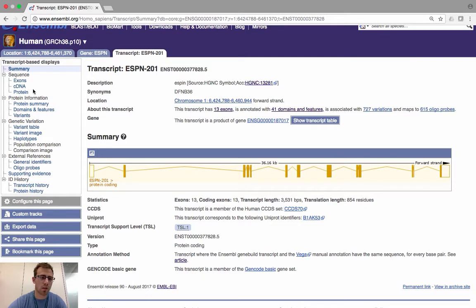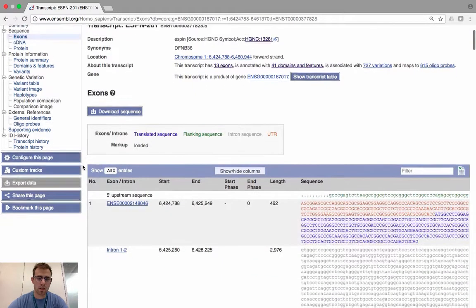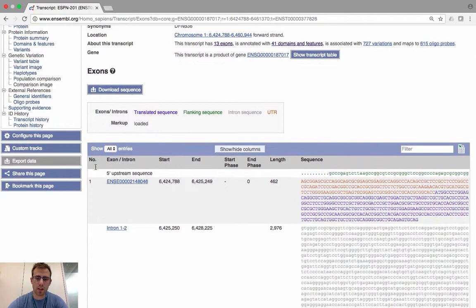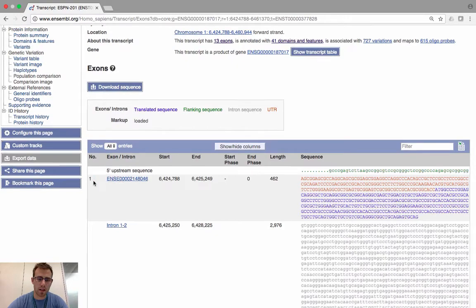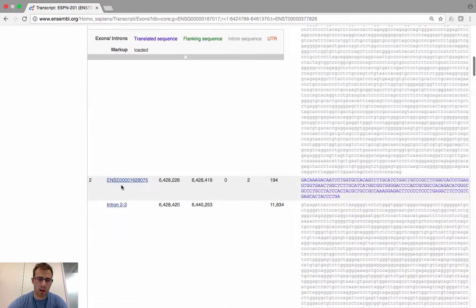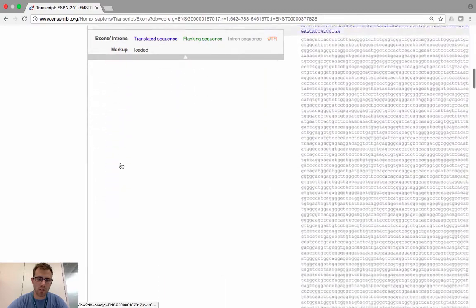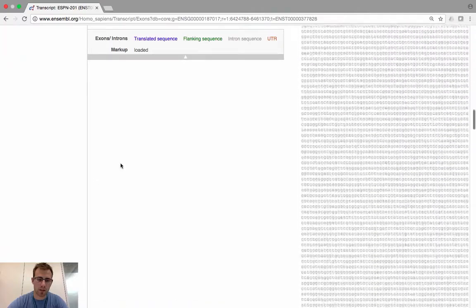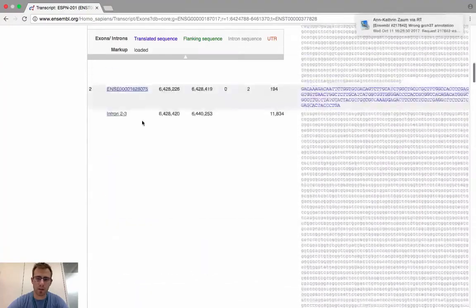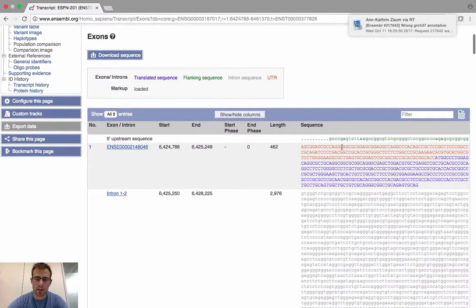To view and download the sequences of these exons and introns, use the menu on the left-hand side. Under the subheading Sequence, you can see a link for Exons. On this page, you'll see all the different sequences for the exons and the introns. By default, the table shows each of the exons and introns of the ESPN-201 transcript in sequence.